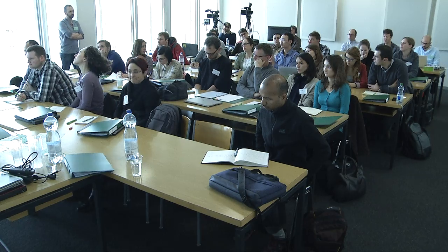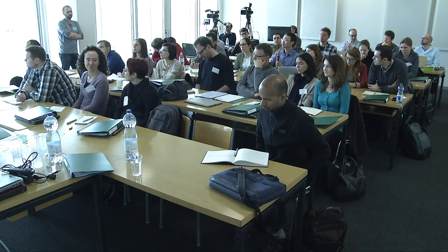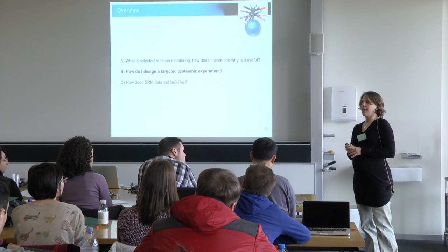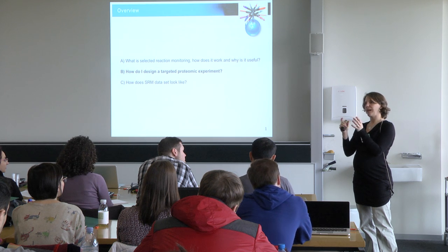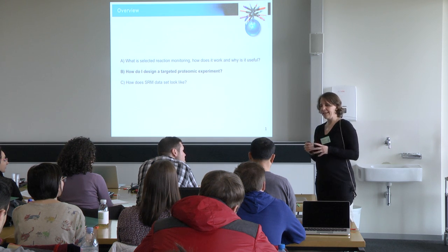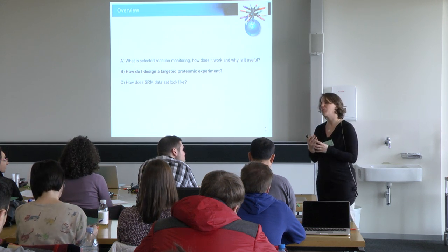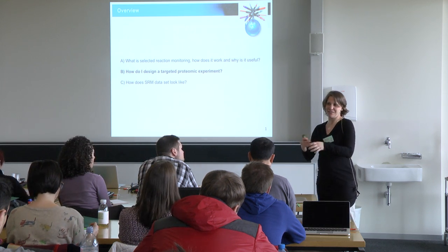Yes, but what if the chromatography between the peptides is different? I mean the chromatography. Yeah. So for example, that's what I said, that you can have a peak with a longer elution than the other one. It's something you could do. The instrument allows you to use different dwell times for certain transitions than others. But usually you take the average peak width as your standard. This is what most people do. And for projects where a lot of peptides and proteins are involved, this is the fastest way to go.